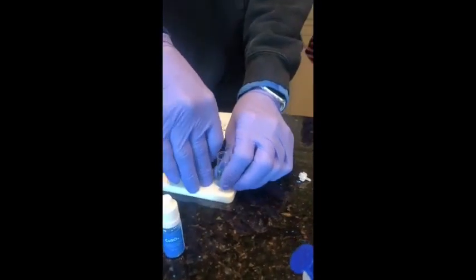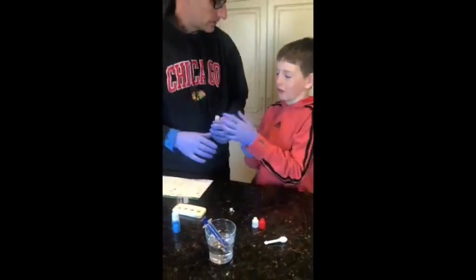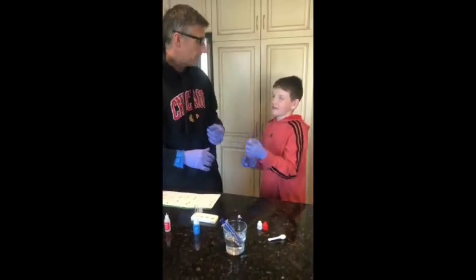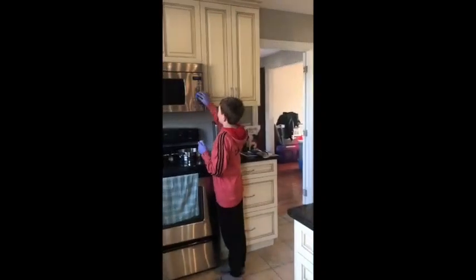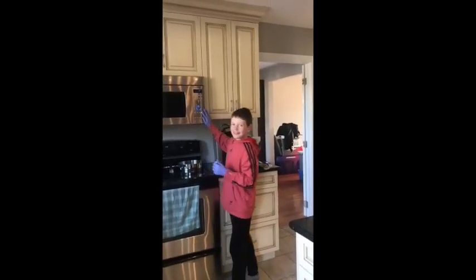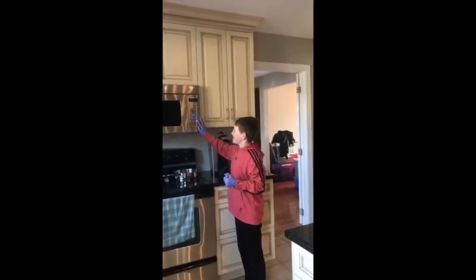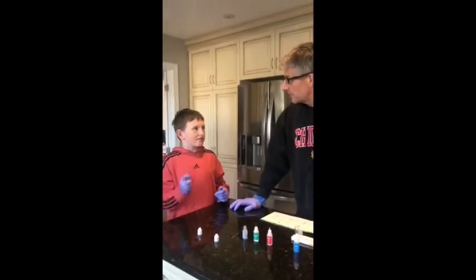Okay. And we're going to put the lid on. Thank you. Duncan's going to set the timer and shake that for 1 minute. I might do it for a little less because I'm sort of lazy. Can you stick with the program, please?